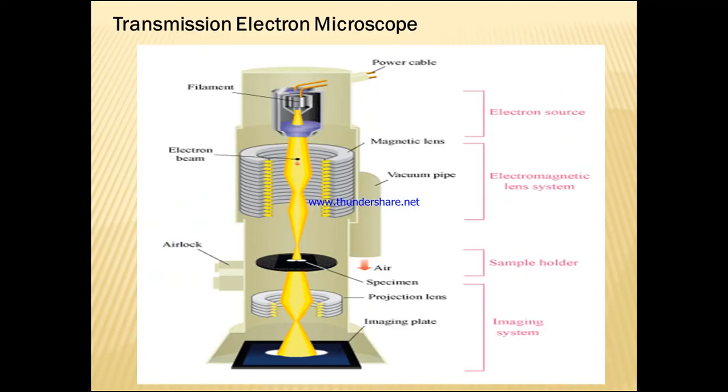The imaging mode provides a highly magnified view of the micro and nanostructure. The nano-analytical mode shows which elements are present in a tiny volume of material. We have an ultra thin section, and the elements present in that volume of material are analyzed in the nano-analytical mode.